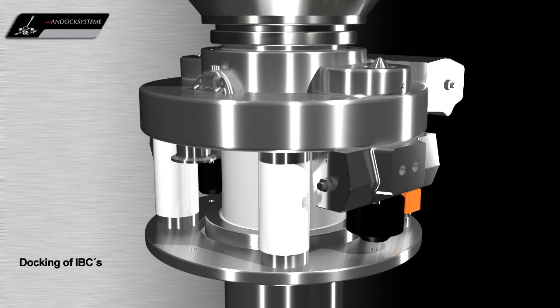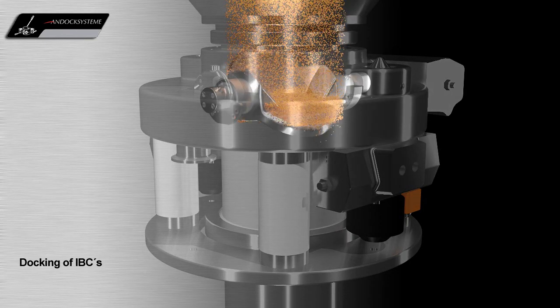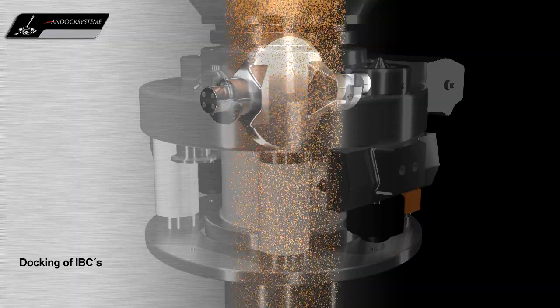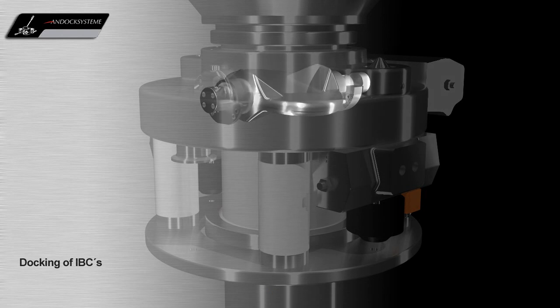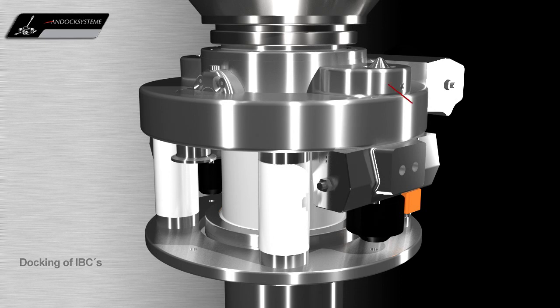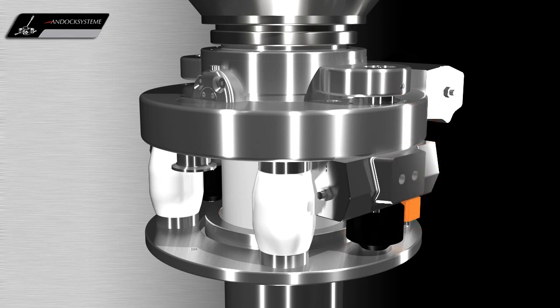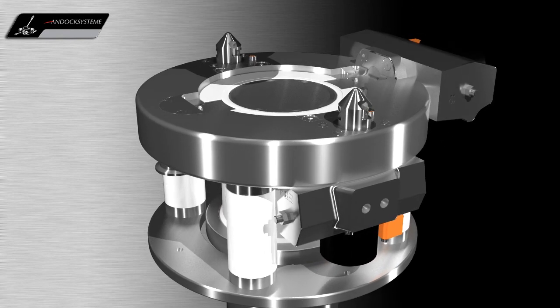After the locking procedure, the discharge process can be started. When the container is empty, the valve closes both halves of the system and the docking system can be unlocked again.